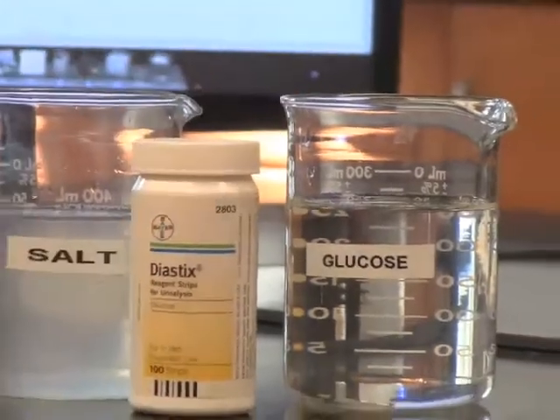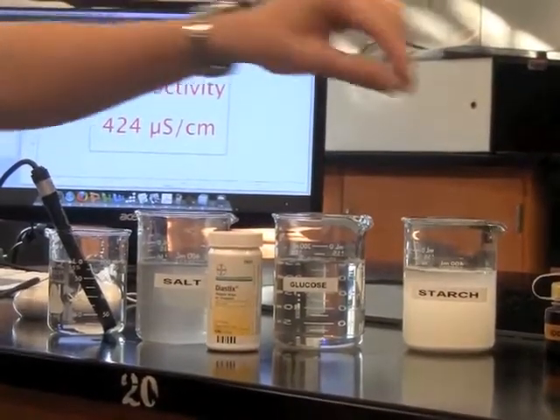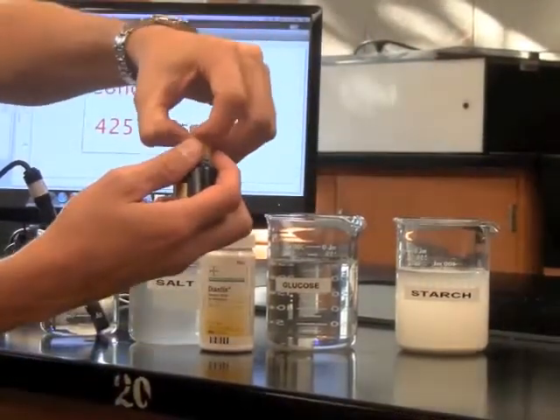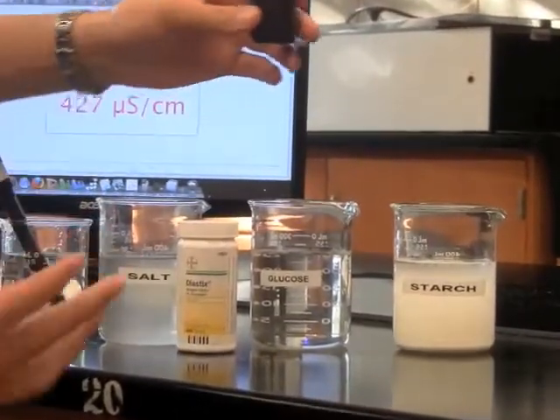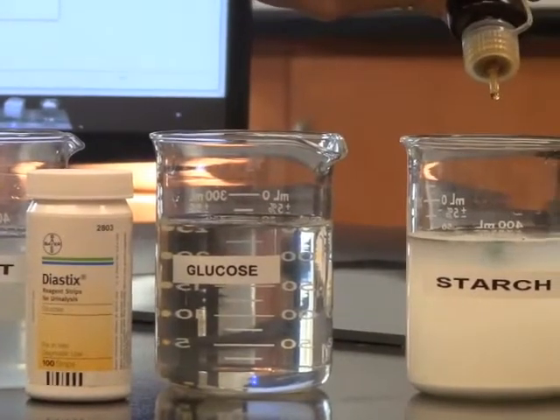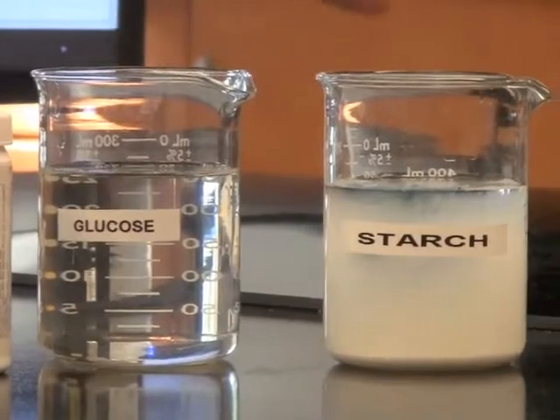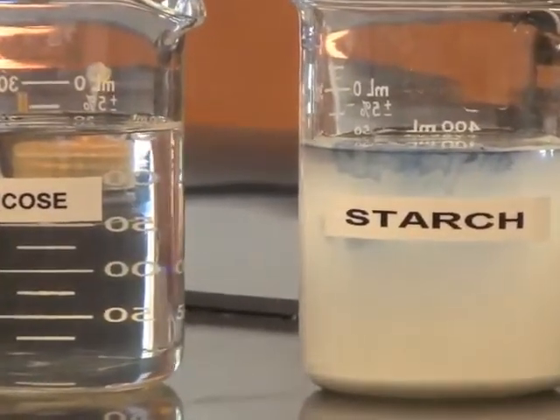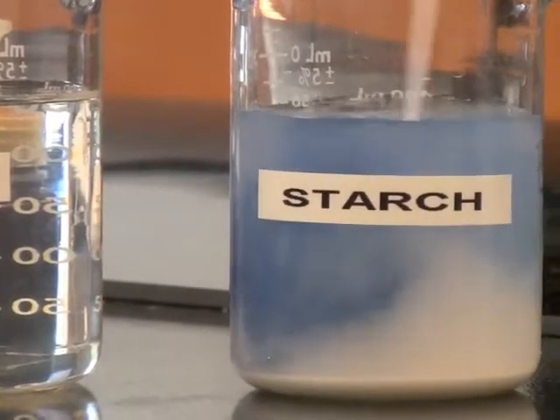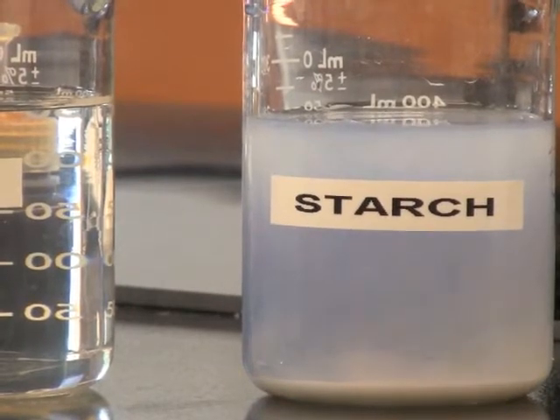Lastly, we have starch, and to determine if starch has diffused, we're just going to use iodine. Iodine will stain starch, and we can't really tell the amount of starch that's diffused, just simply a relative concentration of whether or not it has diffused. And you can see how it turns dark blue, almost purple or black with the presence of iodine.